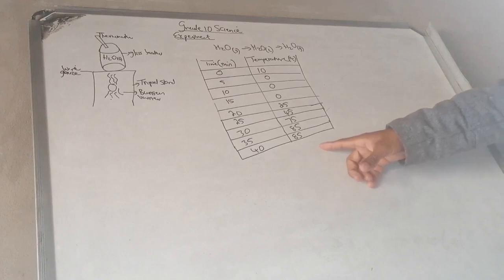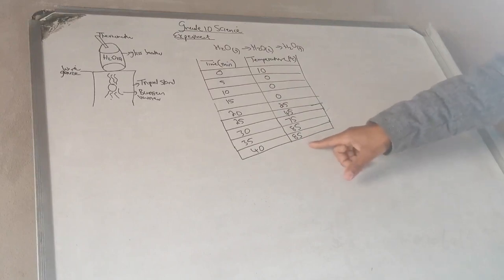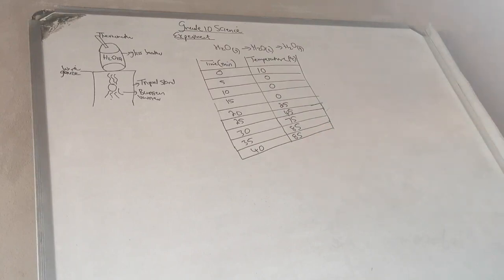So how has water boiled? No, water has not boiled. Water boils at 100 degrees, and we haven't reached 100. And your teacher just stopped. They said we should continue heating and stirring until water boils for 3 minutes. Water has not yet even boiled, and already your teacher said the experiment was over.